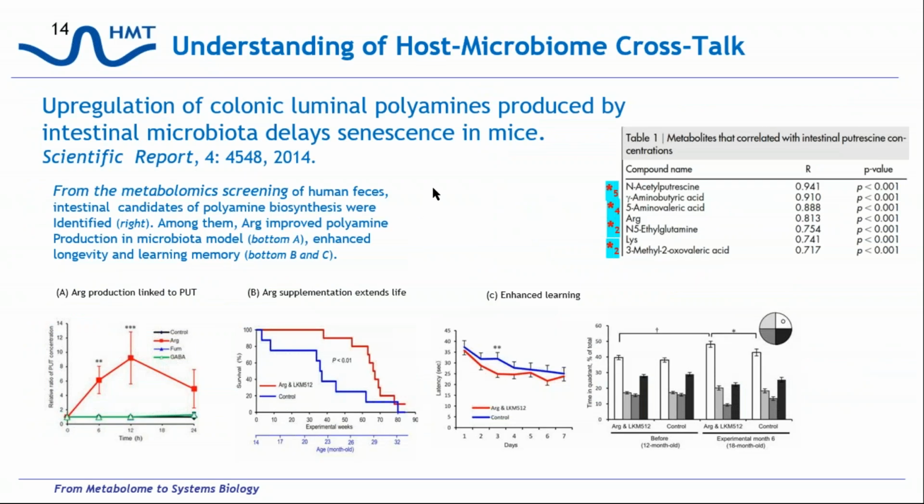In this paper, we were looking at senescence in mice. We actually started out looking in human samples, human feces, and looking for metabolites that had concordance with putrescine. And we've identified several metabolites, including arginine. And arginine supplementation in mice did show an increase in lifespan and an increase in learning capability by supplementing the diet with arginine. But again, in the study itself, we see several metabolites identified, 4 of them which are actually isomers. So just showing the point that we need to develop high resolution techniques to make sure we can specifically identify the metabolites that we see.